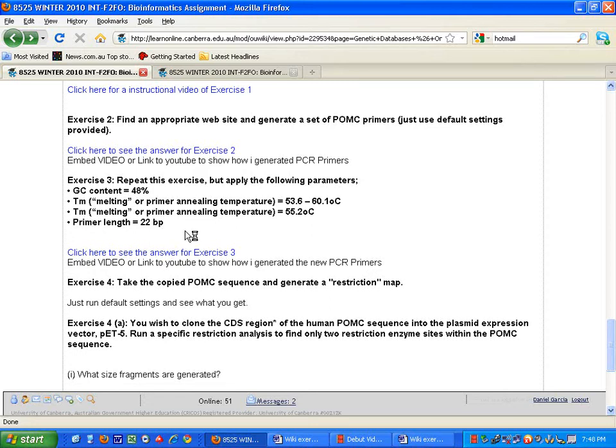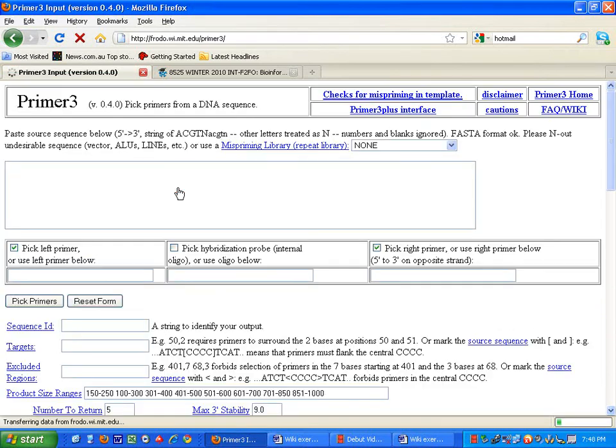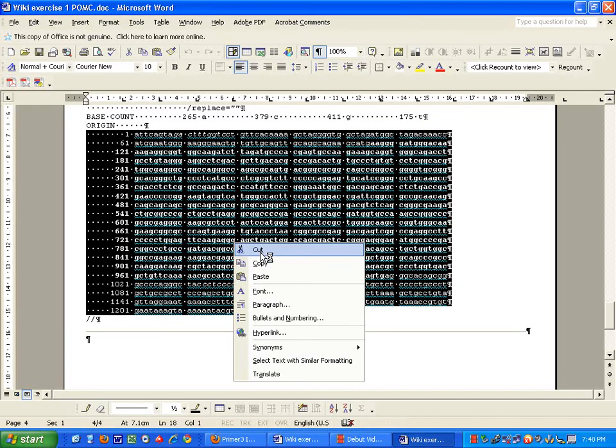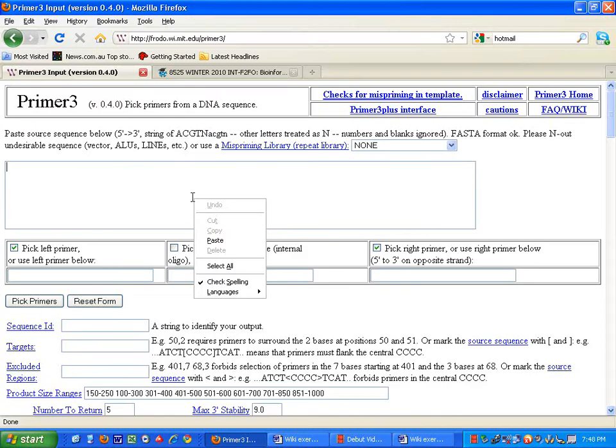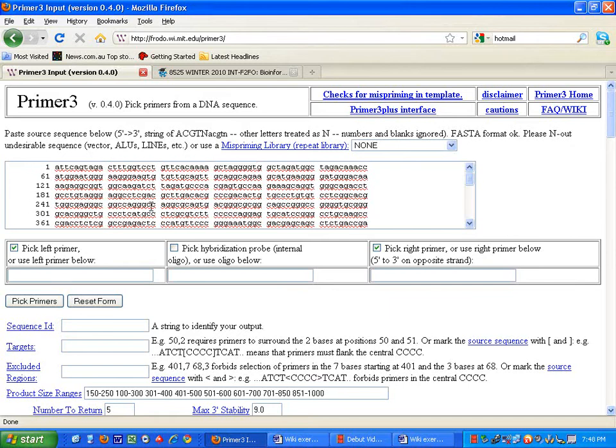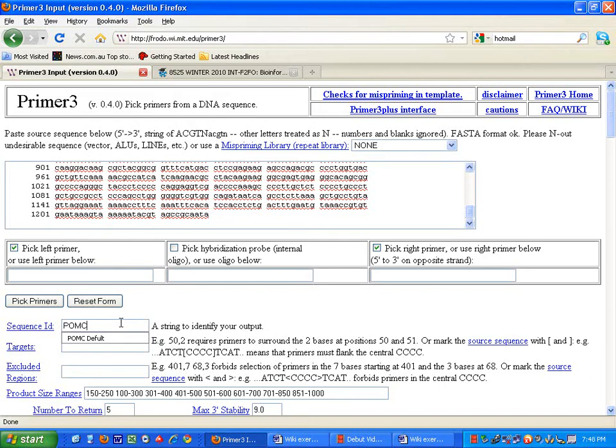So we are going to go back to Primer 3, which is our primer construction website, and we are going to grab from our DNA database of Japan. This is the word file that I originally told you guys to save, hopefully you have got yours there. So I am simply going to copy and paste the gene into the Primer 3 web page, as we have done already in Exercise 2. We are going to name it, and instead of naming it POMC default, I am going to go 48% GC. Very important to name things like this.